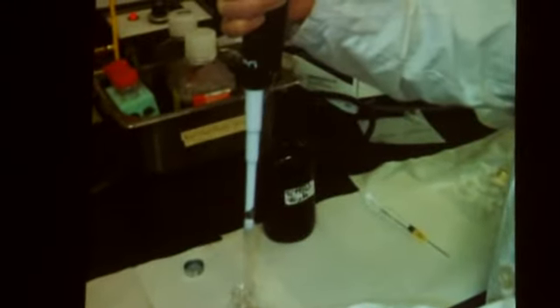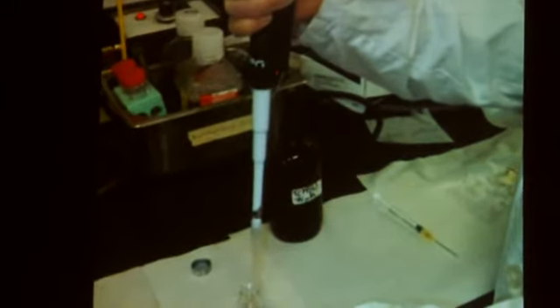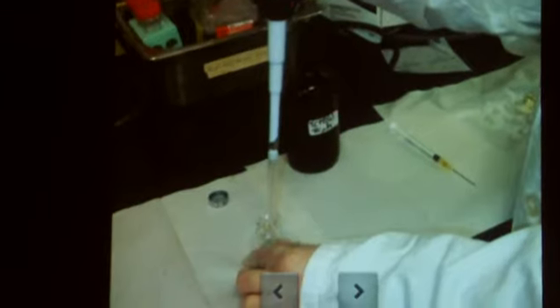Okay, so I'm just going to go through the procedure a bit. We took some photos. Basically, we start off by using a micropipette, and we have vials which will later be sealed with a clamp, so they'll be airtight. We use a micropipette to inject buffer into each vial. Each vial also receives 250 microliters of PCB, and those are the vials, and that's the cap.